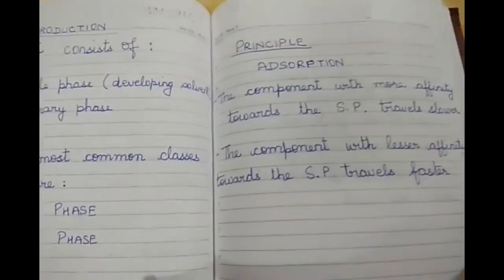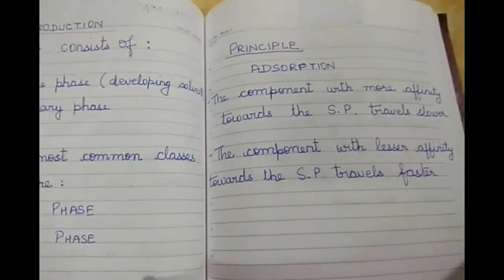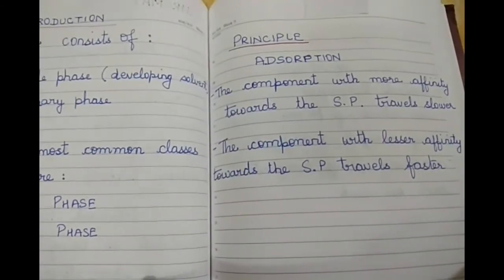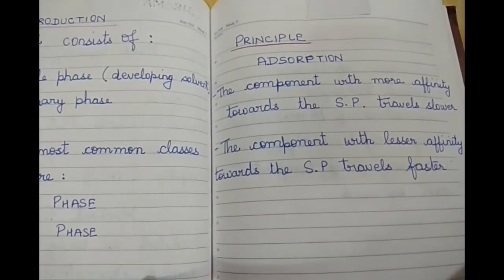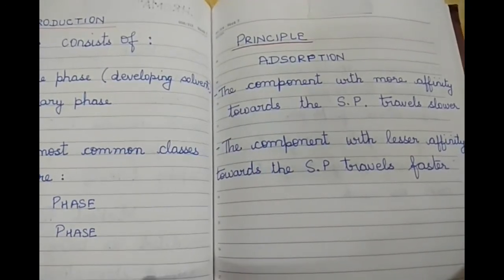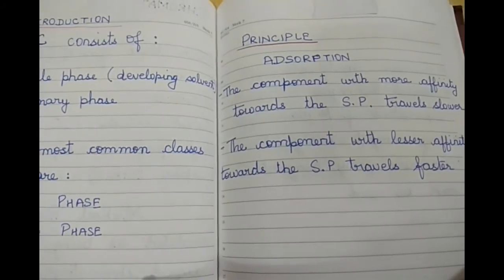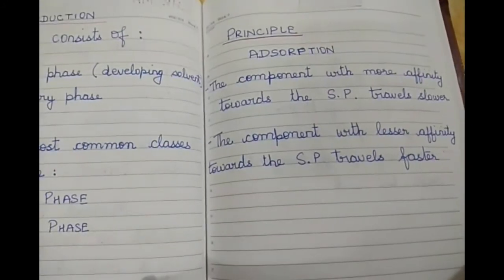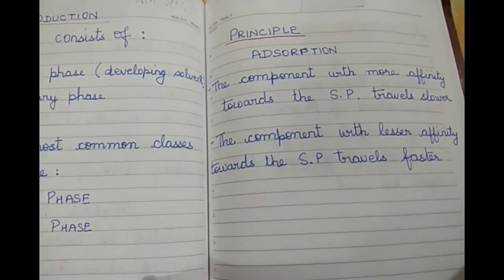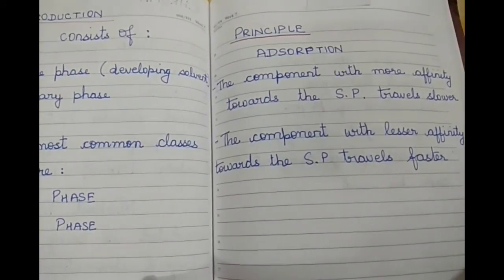Now the principle. The principle of thin layer chromatography we'll be discussing now. Adsorption. The component with more affinity towards the stationary phase travels slower. The component with lesser affinity towards the stationary phase travels faster.